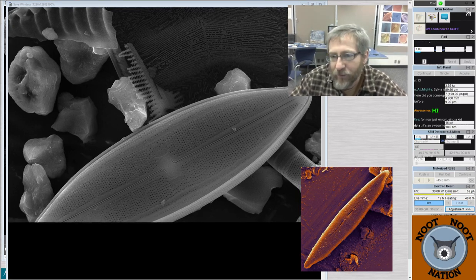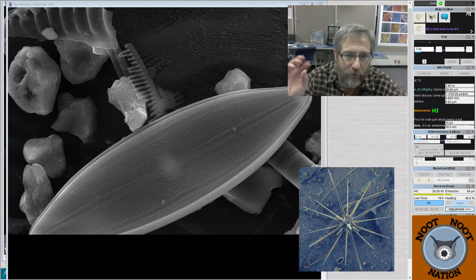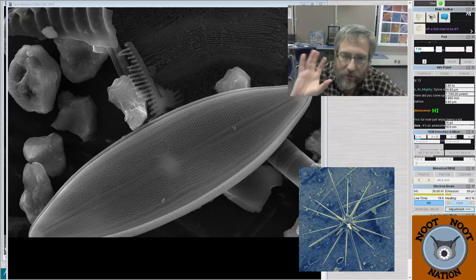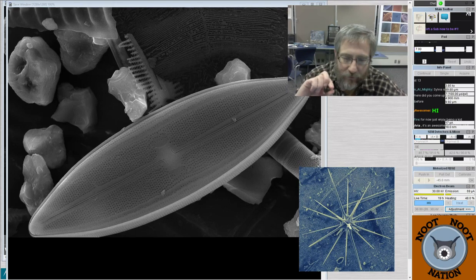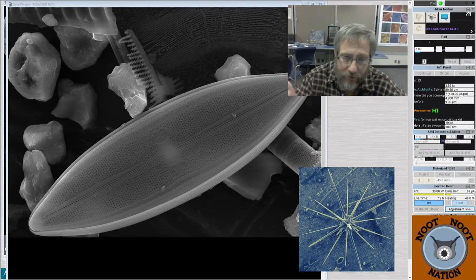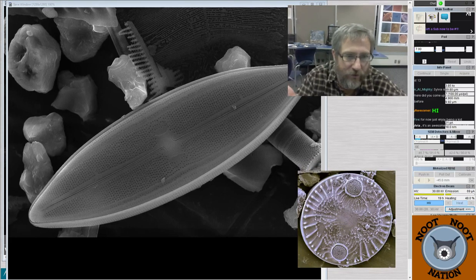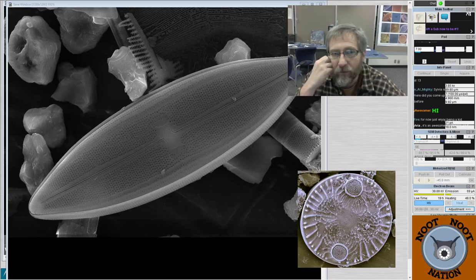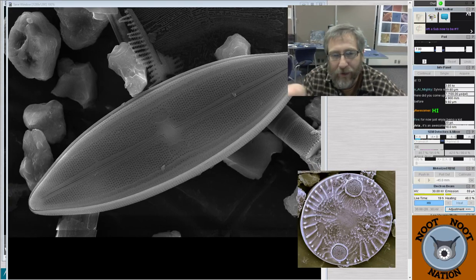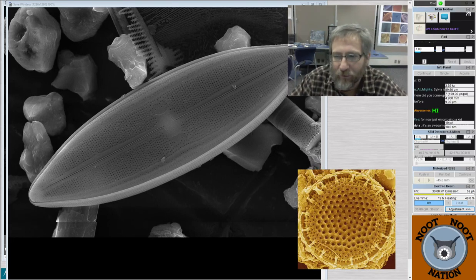Doesn't drying the solution destroy some details? Water has surface tension. So for the diatoms, we're looking at their skeletons, and in the original material the diatoms were in water, but we don't need to see the water part. We just need to see the skeleton of the diatoms. So removing the water when we dry it out doesn't actually do anything. A little bit of the particulate material might still be around.